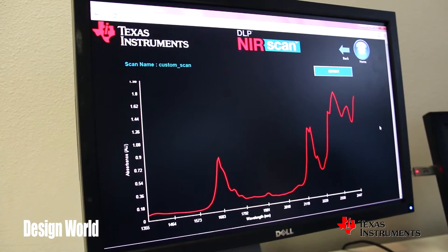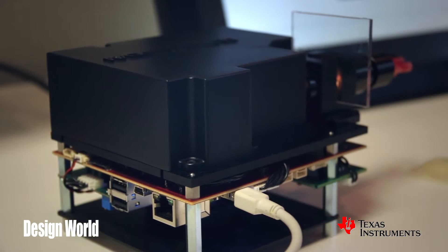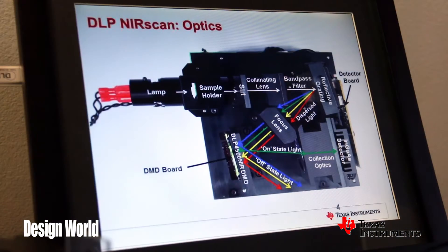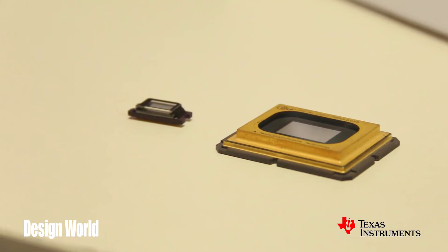The array of millions of micromirrors in the DLP chip is very powerful and very versatile for lots of uses. What we have here is an evaluation module that uses a DLP chip for a spectrometer reference design. If you look at this graphic behind me, I'll show you how it works. What you have is incoming white light — that white light gets dispersed by a grating and creates a dispersion or a rainbow across the face of the micromirror chip.